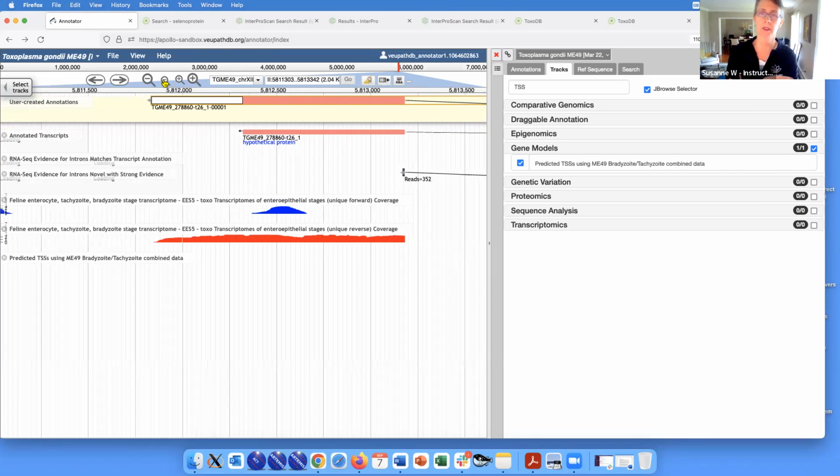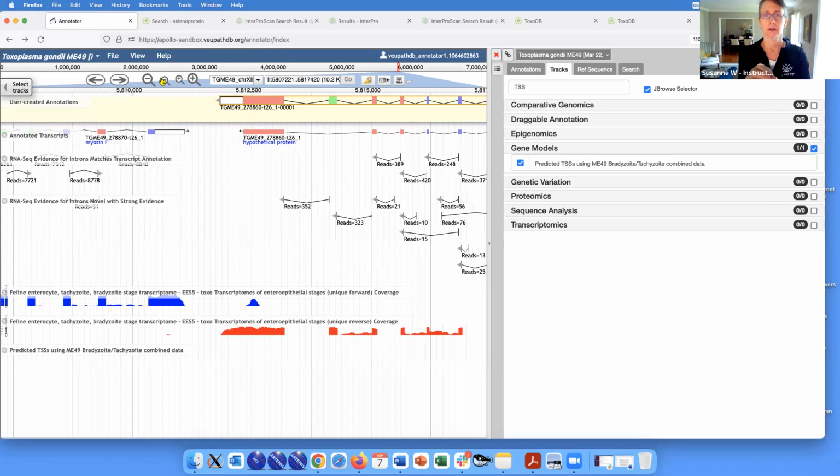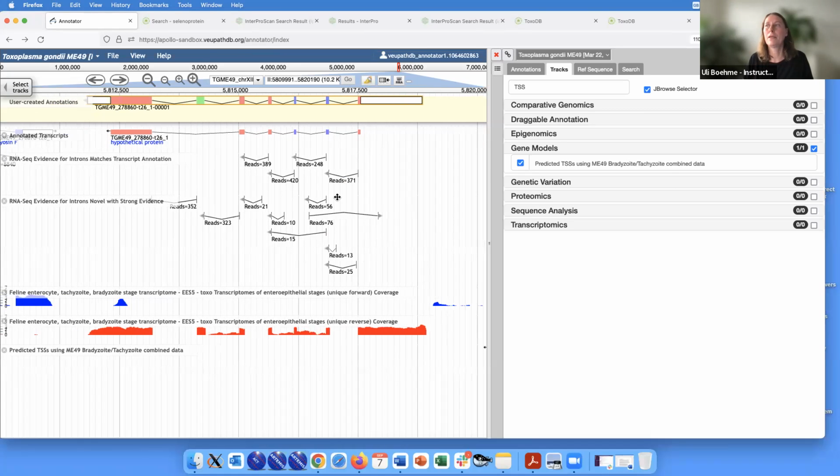Yes. So it's based on sequence, right? Apollo believed that stop site, and so it extended everything onto a UTR instead. And it always goes for the longest here. It might not always be correct, but yeah.